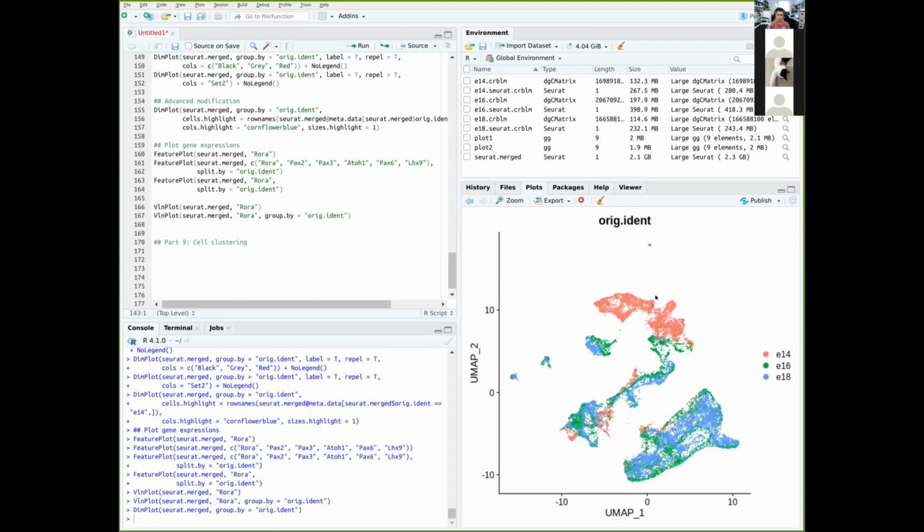For example, this part here appears to be a cluster. This appears to be a cluster. Even this small set of cells within each cluster does represent individual clusters. And you can actually run functions to label or separate these clusters from each other and group them according to their position within the dimension.